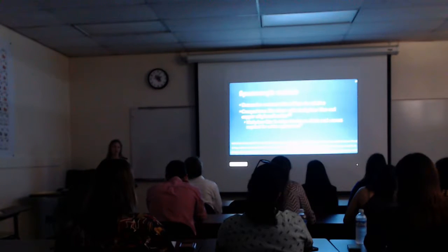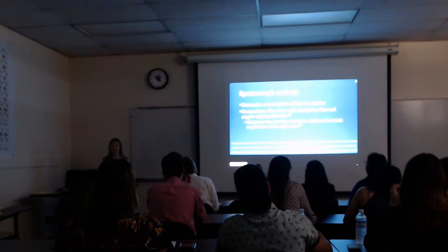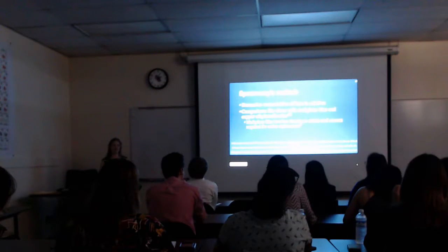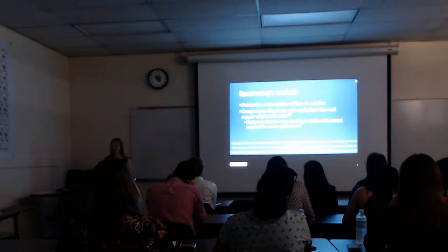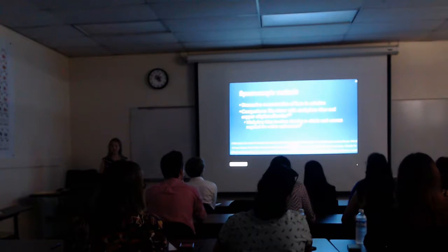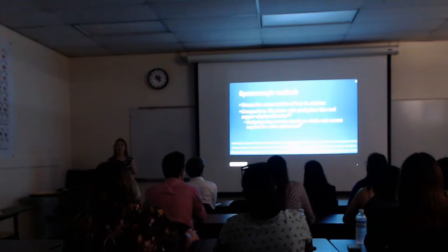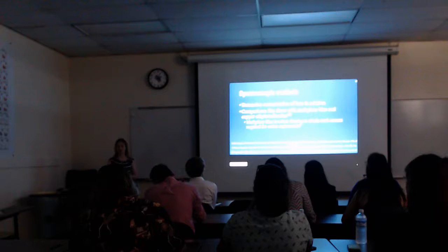So after knowing all of that, we went on to test our spectroscopic methods. These methods require the determination of the concentration of ions left in the solution, not the concentration that's actually in the clay directly. We have to back calculate to get the amount of ion exchanged with the clay. The comparisons that we were able to draw from these methods are like those done with methylene blue and copper ethylene diamine. The methylene blue involved a titration to obtain the total amount of cation replacement, while these methods allowed for the metals to be exchanged and then back calculating to how much was exchanged.